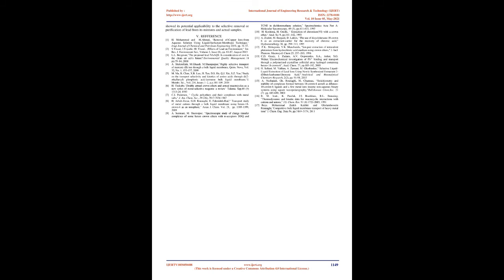After the extraction procedure, all organic solutions were used again for the back extraction procedure with 11 ml of stripping solution under the proposed experimental conditions. That stripping solution was analyzed after the procedure with FAAS, Table 6.